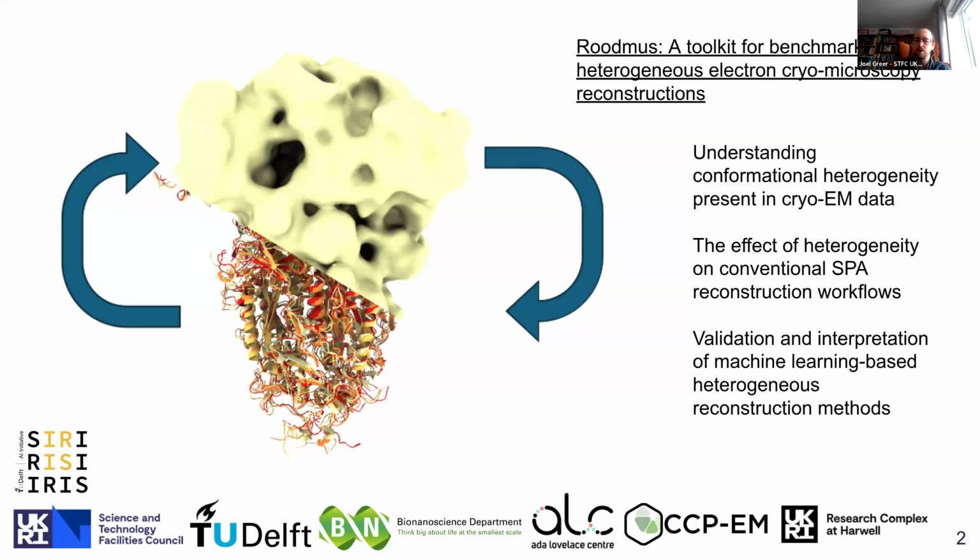But before we get further into that, we want to just make sure that everybody's familiar with cryo-EM data and the basics of processing it in order to reconstruct the structure of molecules. So essentially, to go from the ensemble of states present in your data set to get a representation of the Coulomb potential of your molecule.